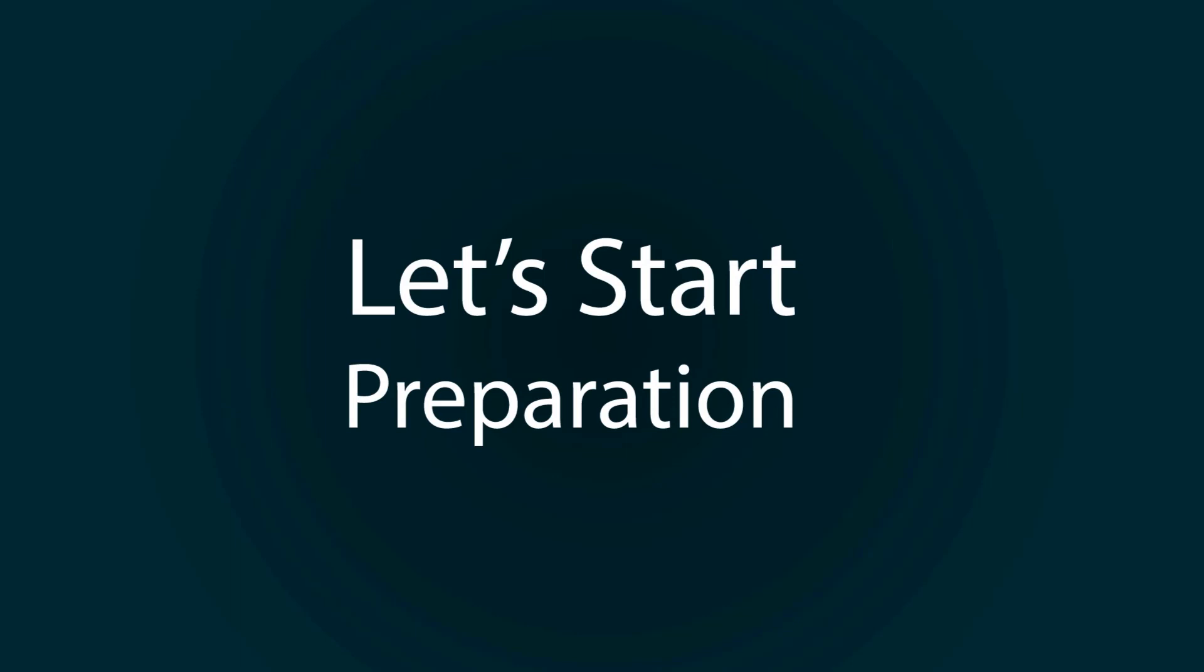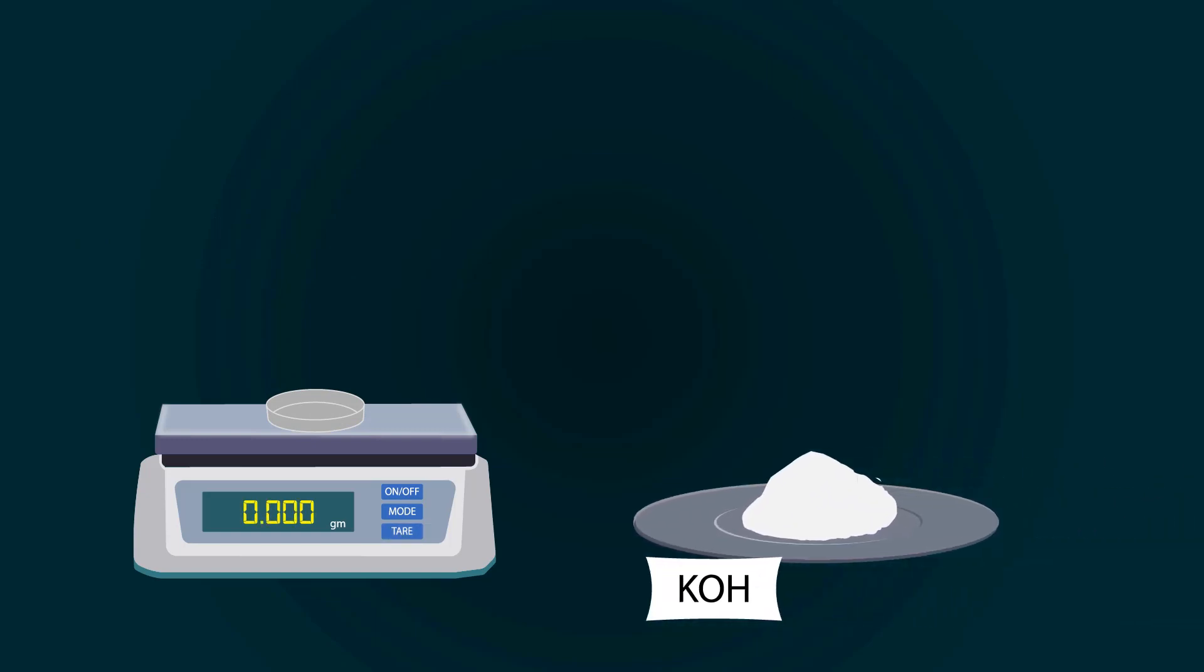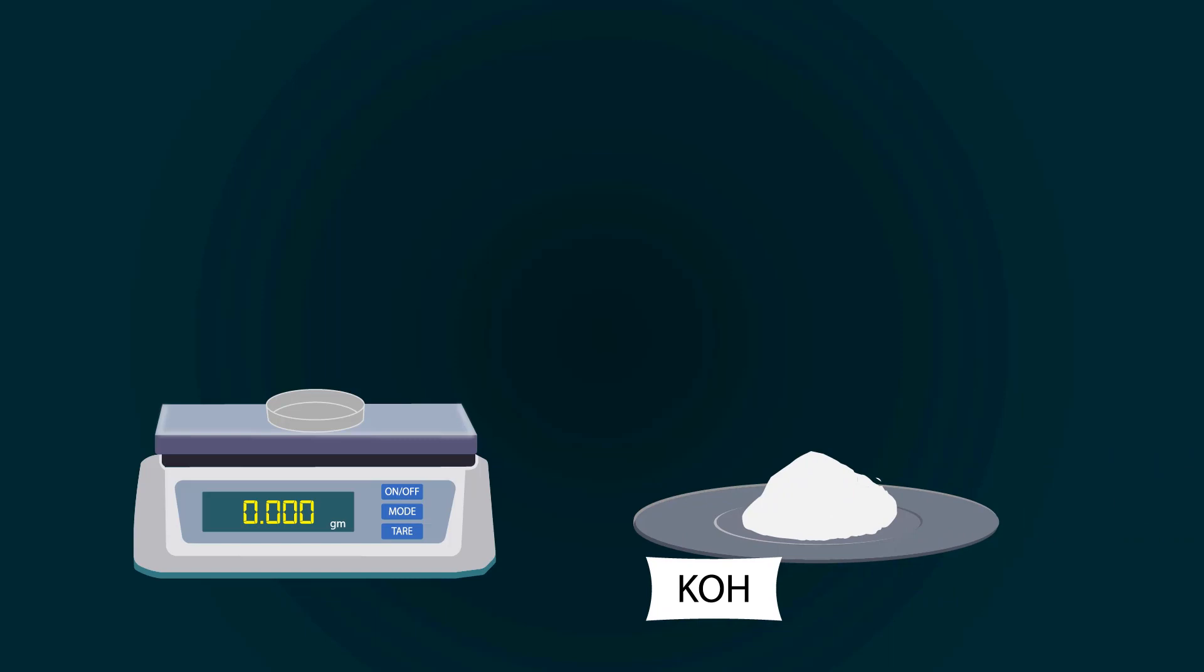Let's start preparation. First of all, take a weight balance and power it on. Now, put petri dish on it. Don't forget to tare it down. Now, start adding potassium hydroxide into the petri dish with the help of spatula. Weigh precisely up to 11.2 grams.